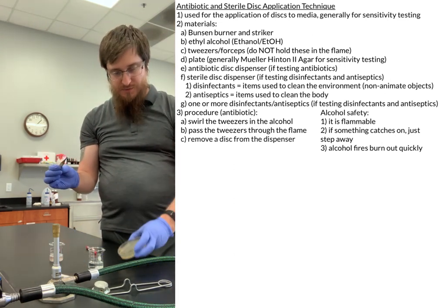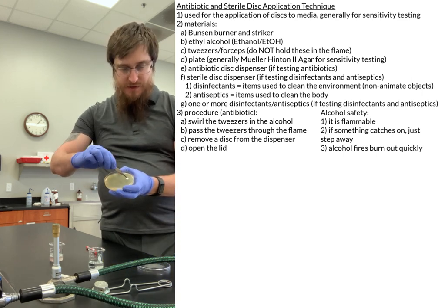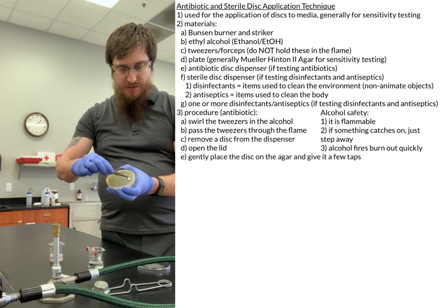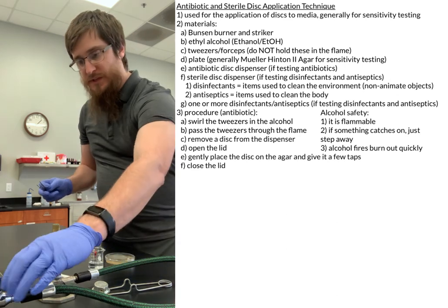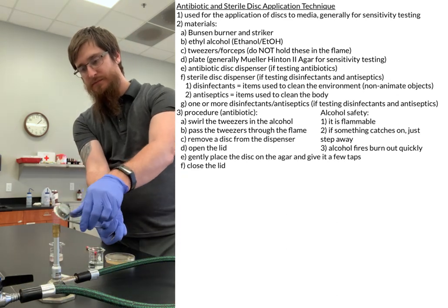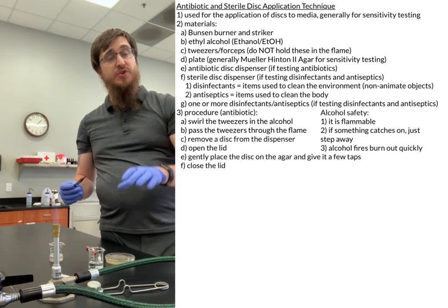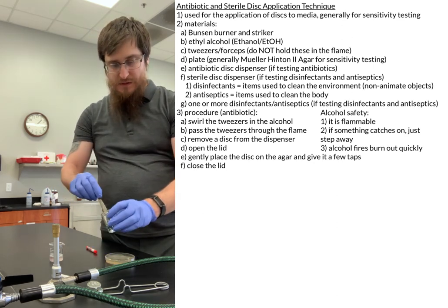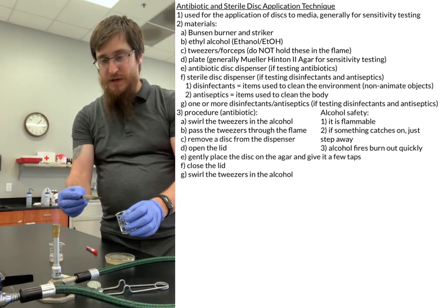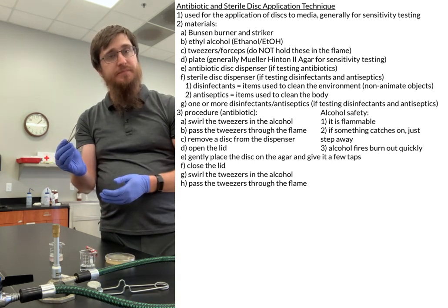So now what I'm going to do is take the lid off of my plate real fast. I have my penicillin side right here. And I'm just going to gently take the disc, give it a couple gentle taps, and that's it. So let me relight this guy right here. After you've done the couple taps, make sure that it stays in there so that when we invert our plates, the discs do not fall down. So at the end, dip it back in the alcohol, pass it through the flame, and that's how we flame it to clean it.